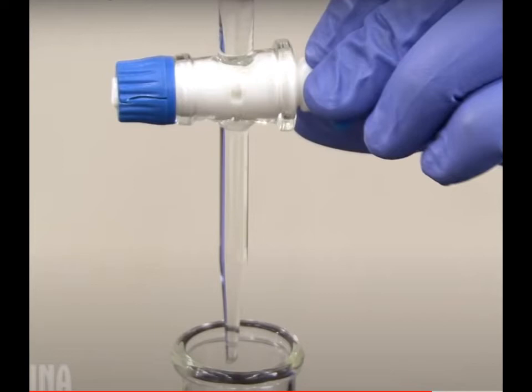And this picture is showing that there's a little hole in the valve. So I'm going to try to circle that for you. That right there, that's a little hole in the valve. So right now this valve is closed because we can see the hole. If you turn the handle and the valve's lined up with the burette, then liquid can flow through that hole. So you're controlling the flow rate of liquid coming through very precisely with this valve.